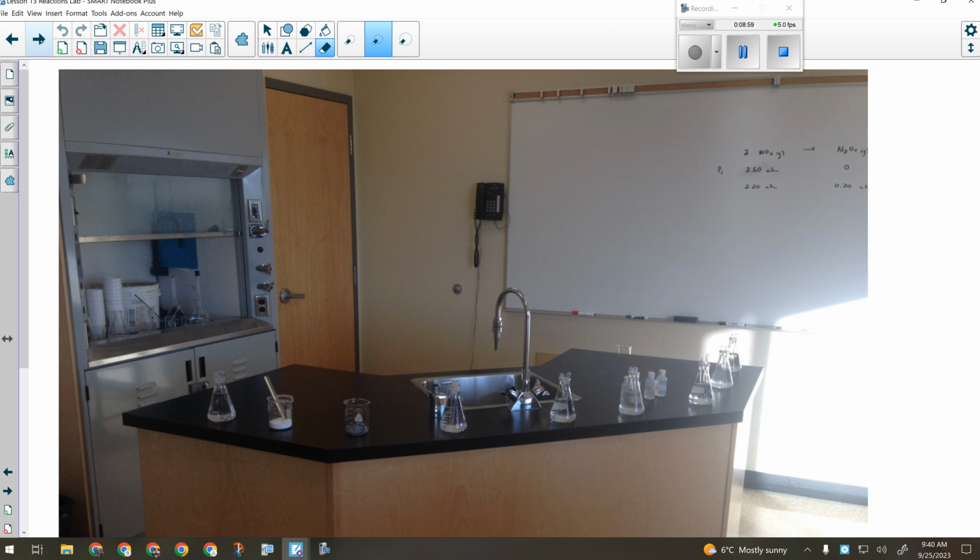So we'll be using that, and for that we'll dispense 4 drops, which is roughly equivalent to what would be in the eyedropper. They're just in their own containers. All right, you need 3 control variables. You can think of a third one. We've already talked about 2. You need to come up with a third one. Like I said, I'm weaning you off of giving you all of them.